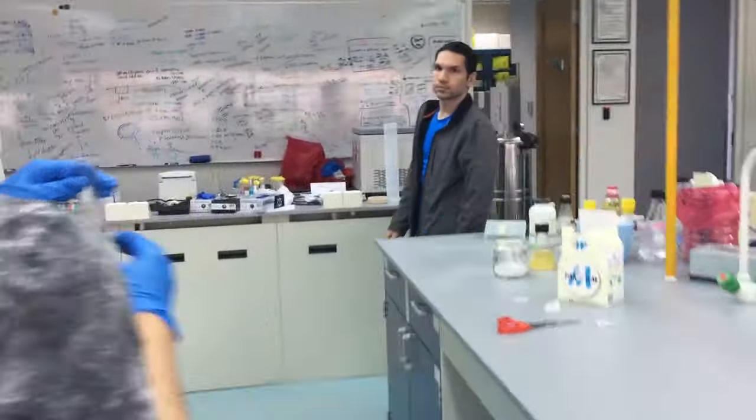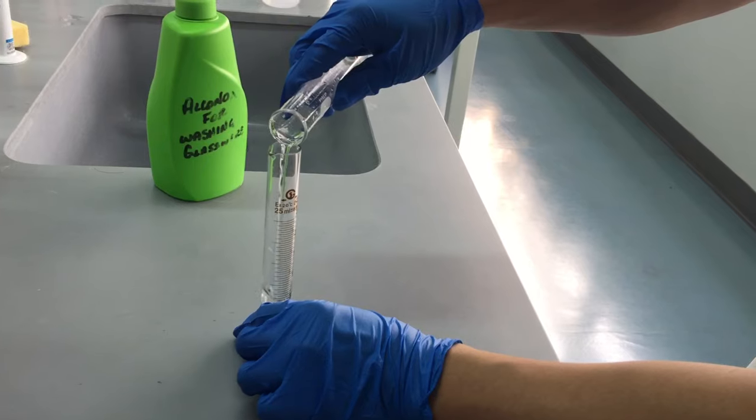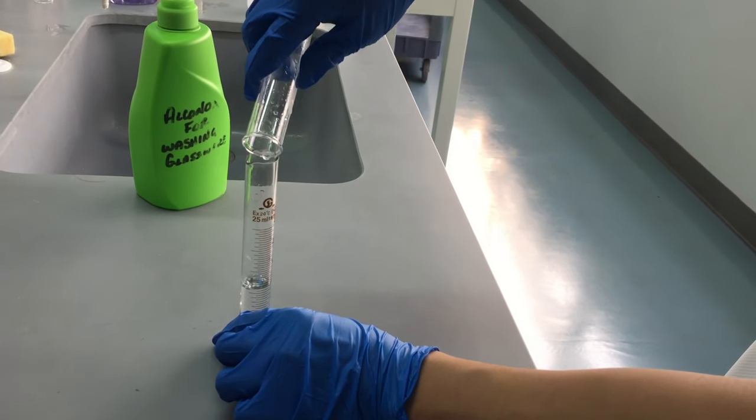Fill the test tube with water until the mark line. Pour the water from the test tube into a measuring cylinder to measure the volume of gas produced in the reaction.